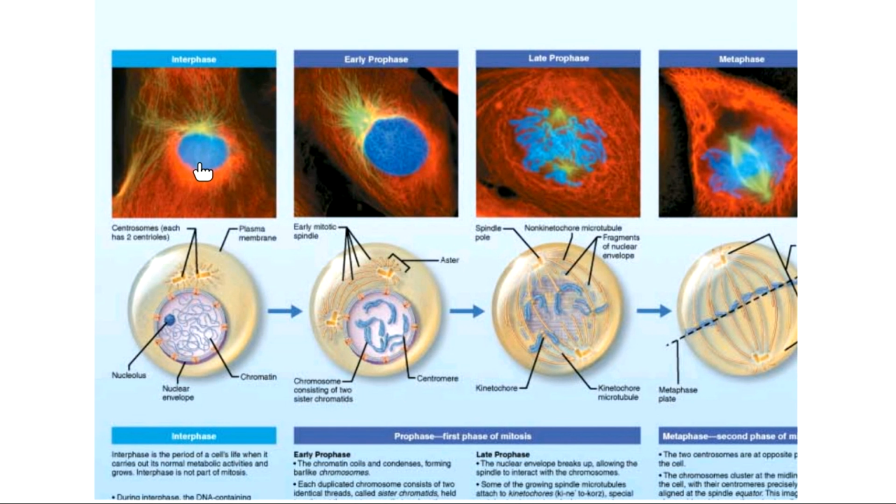My nucleus is completely filled with genetic information. If there are no polka dots in this nucleus, that is how we know that we have chromatin and not chromosomes. When I start forming chromosomes, you start to see little polka dots in the nucleus, because that's taking your spaghetti noodles and putting them into little X's.